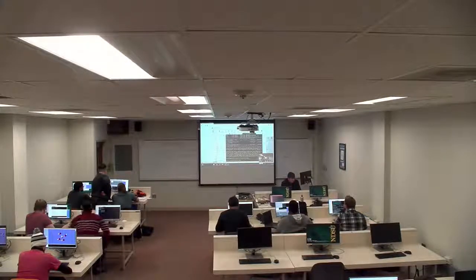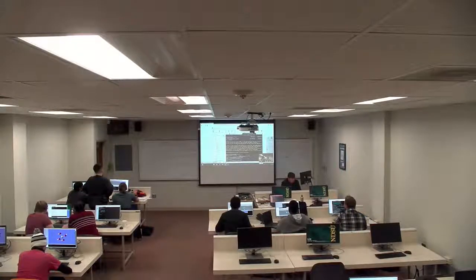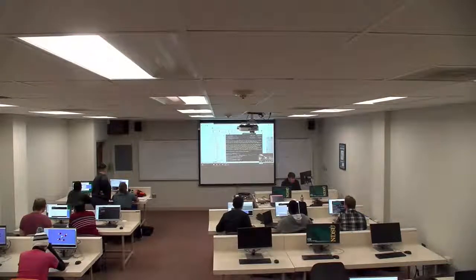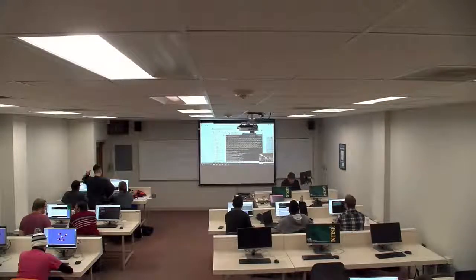Go back to your thing. You went a little too fast. Click, yeah, there you go. Perfect. Alright, so let's try it. Now it's the title. Just put test job for titanium OH4, TiOH4. Go to link.